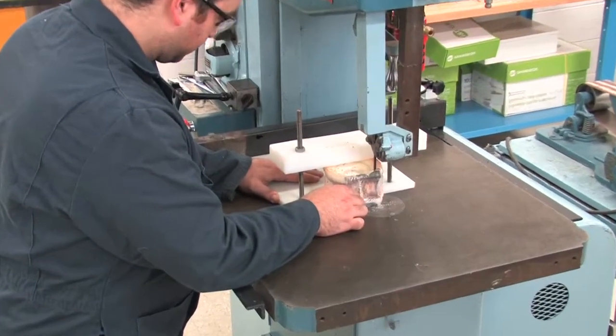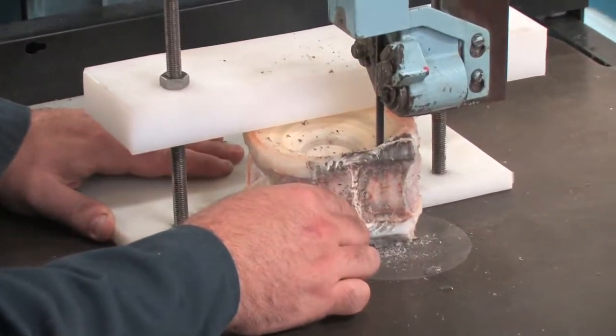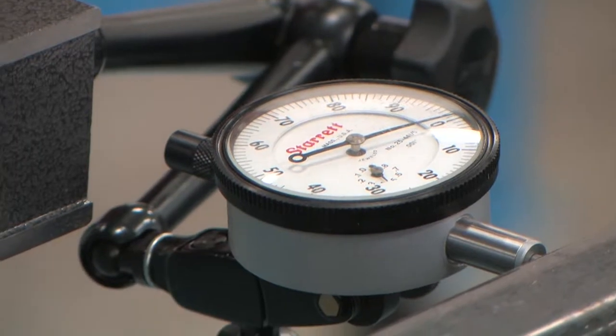While cutting, push the vertebra at a steady even pace. You will have to manually adjust the guide each time a new cut is made. We use a pair of dial indicators to measure the adjustments.